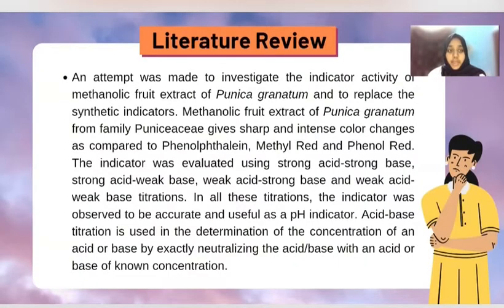Thank you, Cheryl. An attempt was made to investigate the indicator activity of methanolic fruit extract of Punica granatum and to replace the synthetic indicators in this experiment. This methanolic fruit extract of Punica granatum from family Punicaceae gives sharp and intense color changes as compared to phenolphthalein, methyl red, and phenol red.